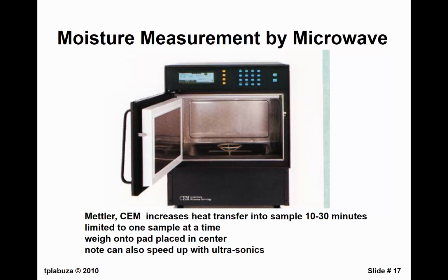Another faster one is an oven that also includes microwave heating. So you get better heating of the product than you do with a closed oven that doesn't have convection, because you're penetrating by waves into the product itself. One sample at a time. You're doing microwave, right? Yep, that'll be good. And you're doing convection oven as well?